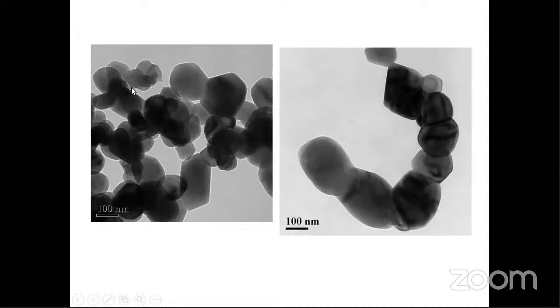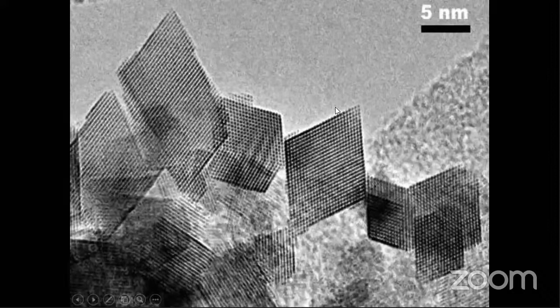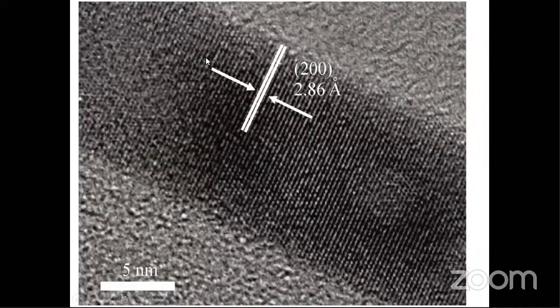Here a nanorod is lying over here. The lattice fringes are there, and we can find the lattice spacing or d-spacing from this scale bar also. Actually, this can be done with software. So what I say is that the lattice planes are clearly observed. Any kind of dislocation defects can be easily seen.